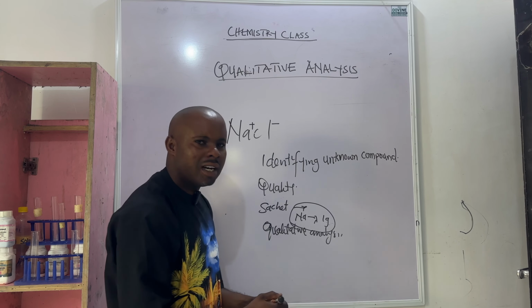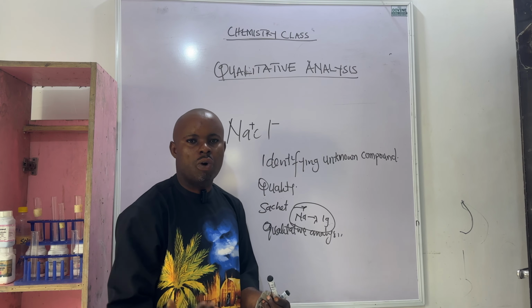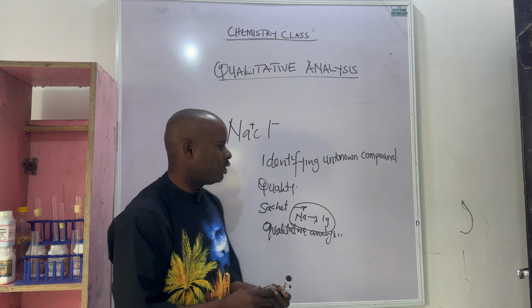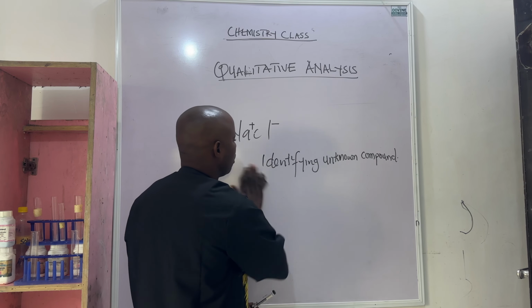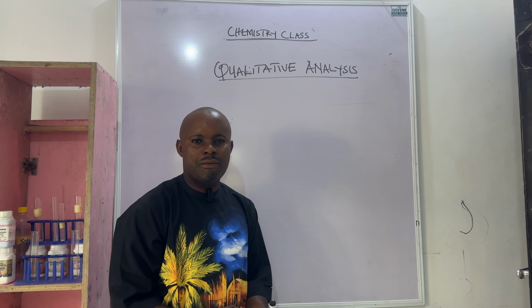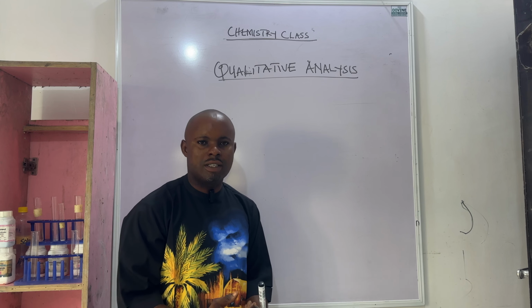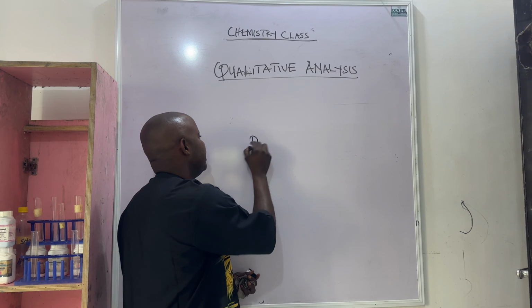And this qualitative analysis follows a systematic process. In this aspect, you're going to run through salt in case of an SSC examination that is coming up. So we are going to talk more about salt. We're going to discuss the steps that are involved in qualitative analysis. What are the steps involved in qualitative analysis? One of the steps is known as the preliminary stage.